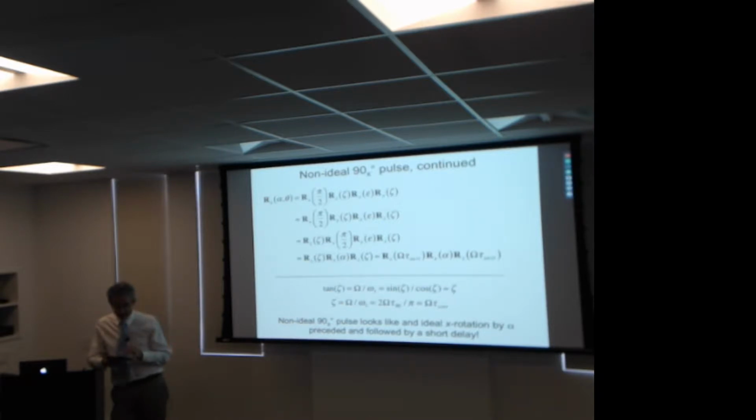So since this looks like a frequency times a time here, I can think of the off-resonance rotation as being a little bit of a z rotation for some time delay, a rotation around x, and then another little z rotation. Yeah?